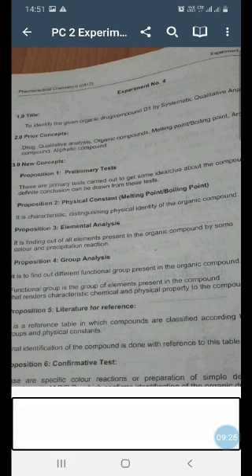The next group of which my compound is a member is group 5, suppose. Then again I will do the same thing with group 5, and I will get a positive test for one of the compounds from group 5. There I will stop. So this is called functional group detection or functional group identification. Just keep in mind, you have to perform only the general test applicable to that particular group. Say for example acids, esters, ethers, like that.